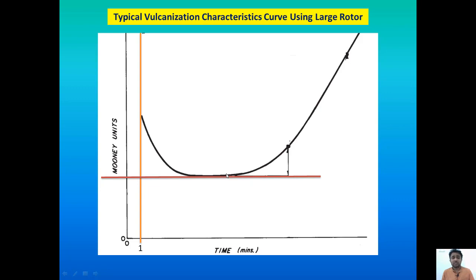Once the heat and sulfur are there, what will happen? It starts to make sulfur crosslinks. Once the crosslinks are formed, what will happen to the viscosity? It will increase, right, due to temperature and the presence of sulfur and accelerators in the compound. The material starts to develop crosslinks among polymer molecules. Then the viscosity will increase.